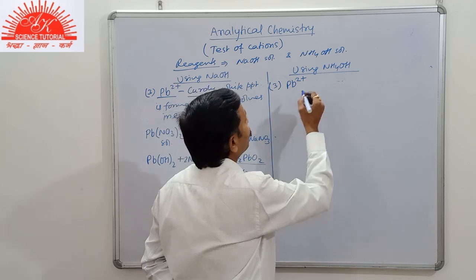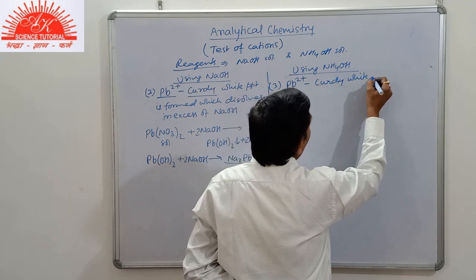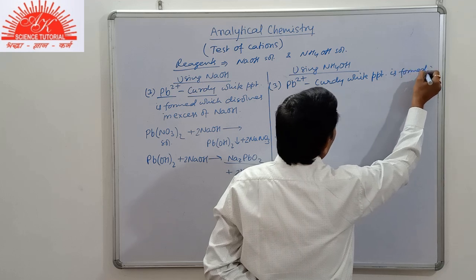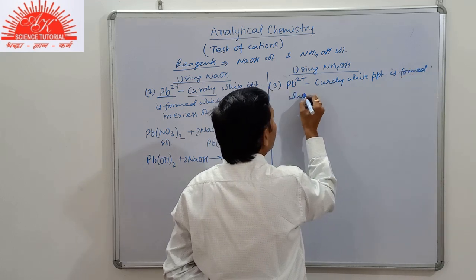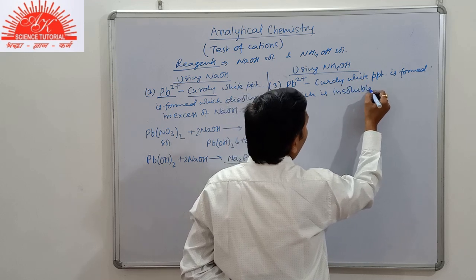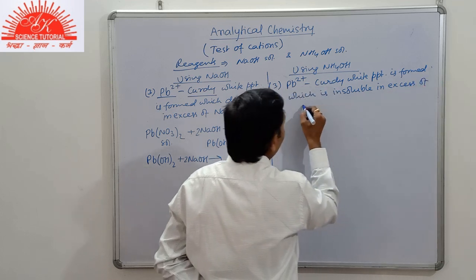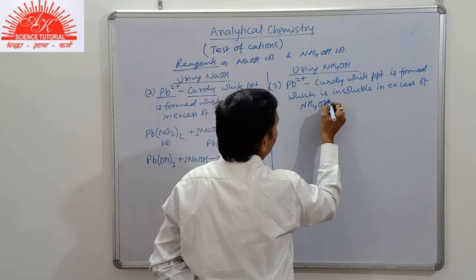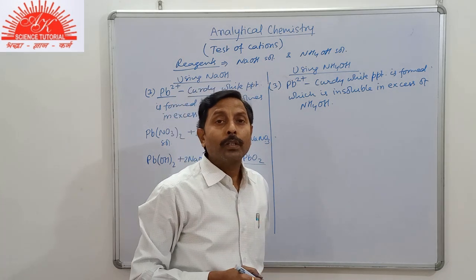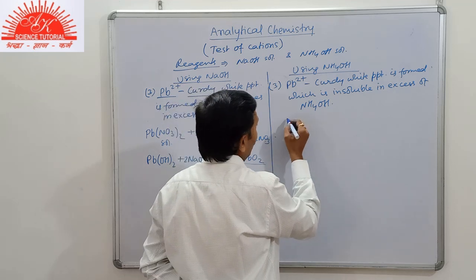But for lead, again curdy white precipitate is formed which is insoluble in excess of NH4OH.